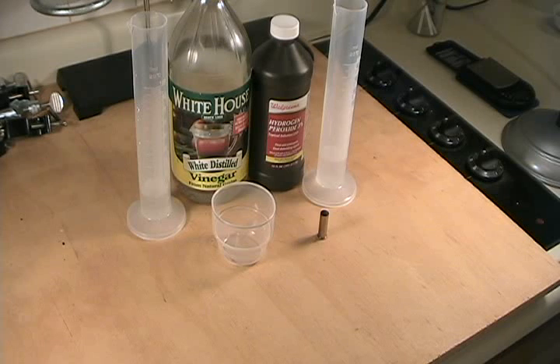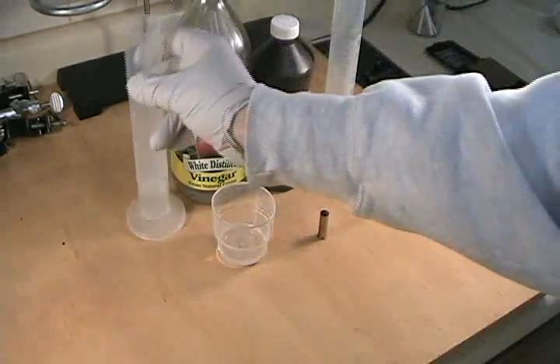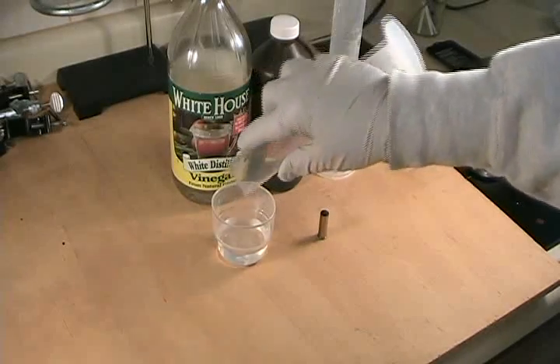We don't need a lot of specialized equipment or chemicals to do this procedure. We're going to use ordinary white distilled vinegar, which is actually 5% acetic acid, and 3% hydrogen peroxide from the drugstore. You need to make up the mixture of these two solutions immediately before you start the procedure and then discard the spent solutions afterwards. The ratio of the chemicals is fairly important — we want to use 10 parts of hydrogen peroxide to 7 parts of distilled white vinegar. I have a specimen here which is a fired 38 special cartridge case, and I've handled it normally to put fingerprints on it without making any special effort to make good prints. So we'll start by mixing 20 milliliters of hydrogen peroxide and 14 milliliters of the distilled white vinegar.